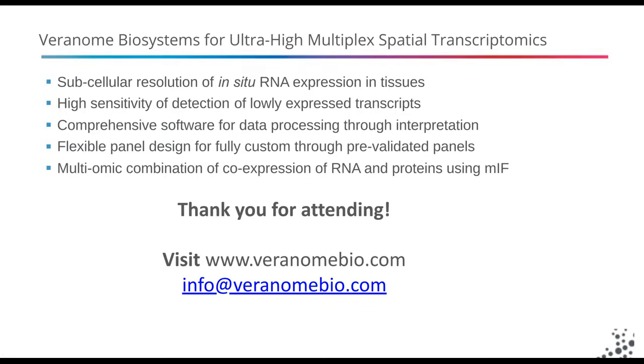Great, thank you, gentlemen. We've got time for a couple more questions. Our next question is, do you clear the tissue? Sure, that's a great question. A lot of the early work that we've been doing with our collaborators is to bring in a host of different tissue types, different qualities, that sort of thing. As you probably know, different tissues will have varying levels of autofluorescence or varying levels of overall background noise.